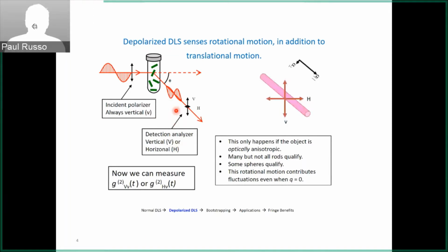This requires something that has optical anisotropy. The polarizability is the term alpha, and that's how easy it is for the electrons to move. The electrons have to be more movable in one direction than another for this to work. It's really not the rod-like shape, it's whether the electrons move. We have other particles that are almost spherical, but inside them they have an optical axis that makes it easy for the molecules to move one way or another.